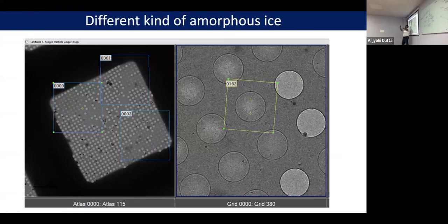Our sensor, this K2 camera or CCD camera, whatever we are targeting, as I mentioned, we want to focus outside, not inside here, because if we start focusing there, it will melt the ice. So now our spot, whatever we are targeting, is only this much area, not bigger than this one. So we can adjust that.